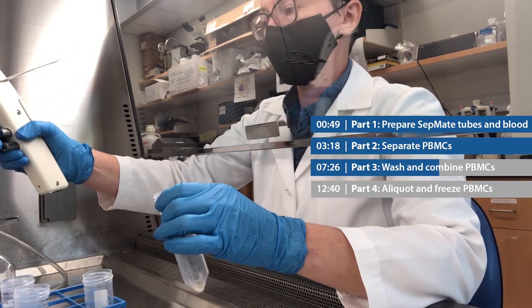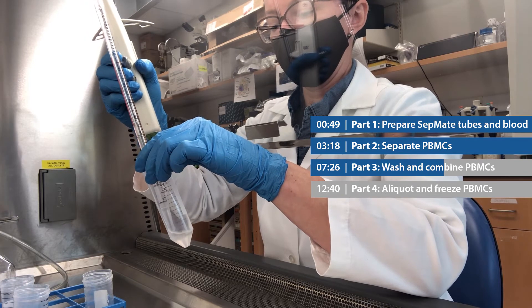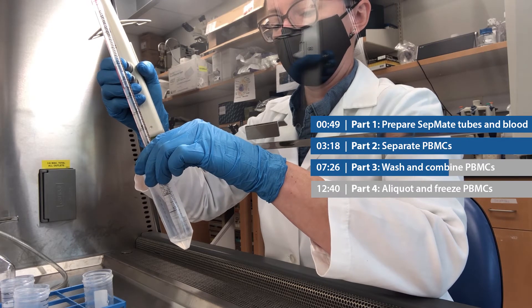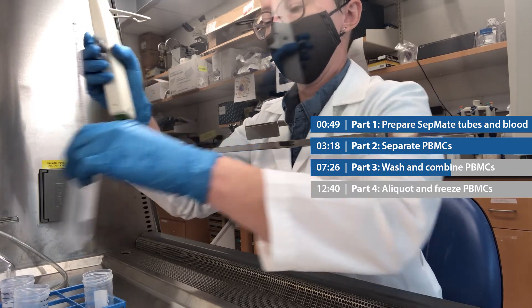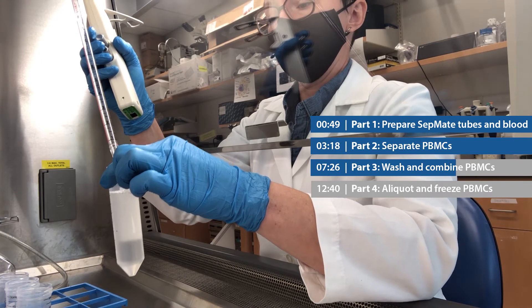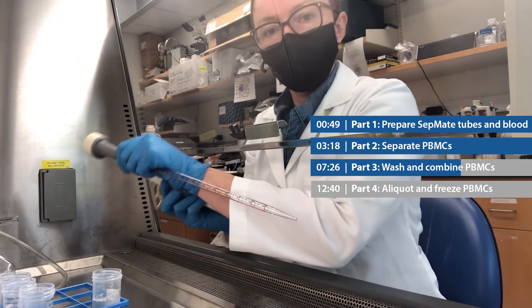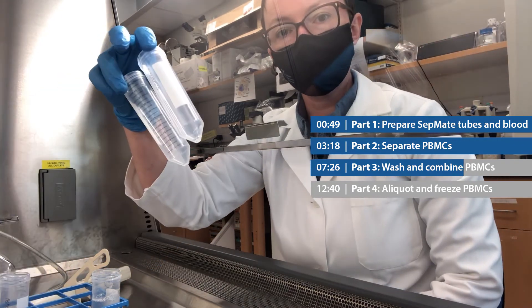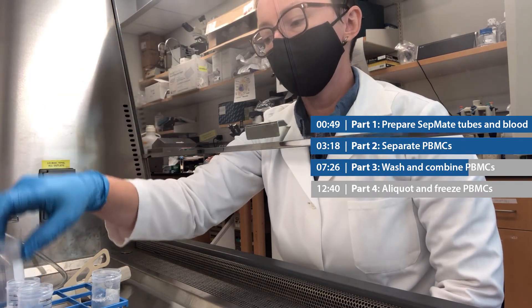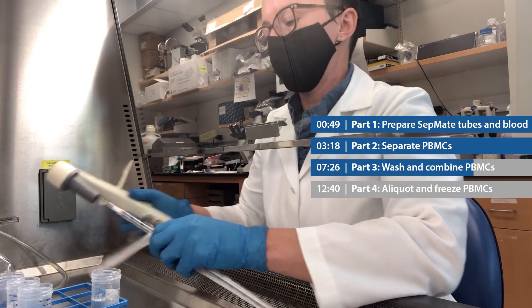Now I'm doing the same thing with tube number three and tube number four — 10 mils of DPBS, pipette up and down, and combine with the rest of the cells. Just because these cells are so precious, I'm not going to throw these tubes away just yet. I'm going to do one more 10 ml DPBS rinse of those three tubes and combine it with the other cells.